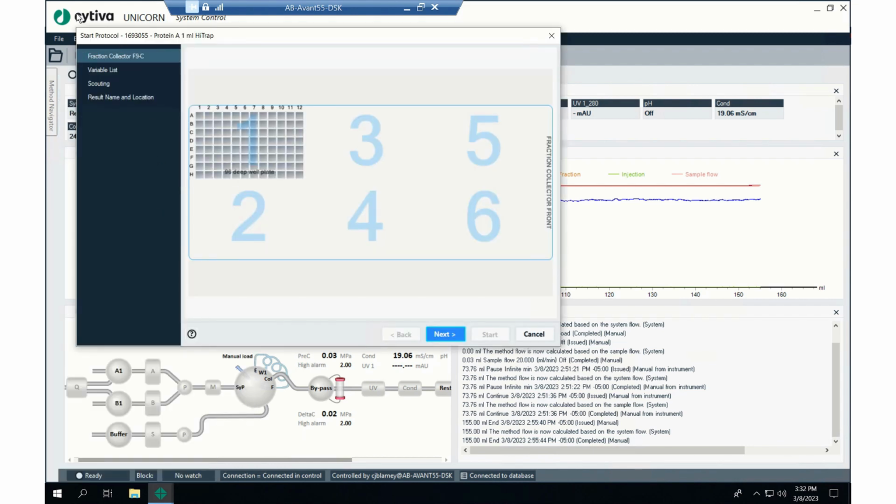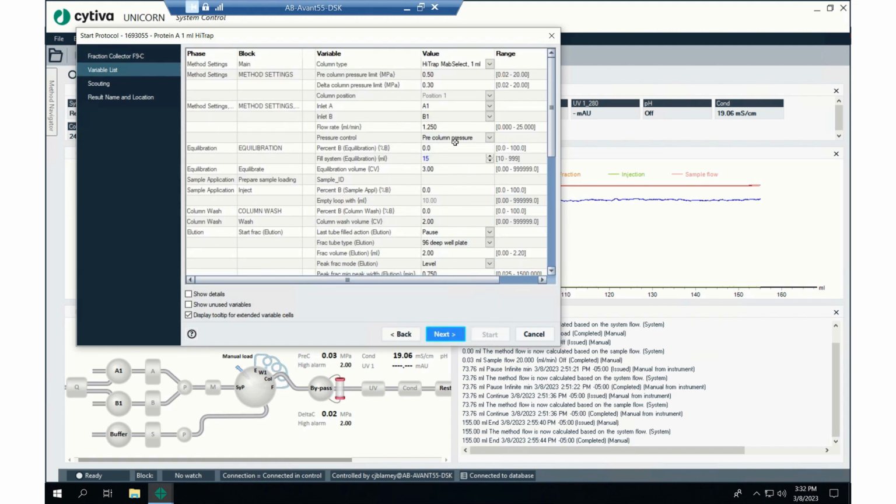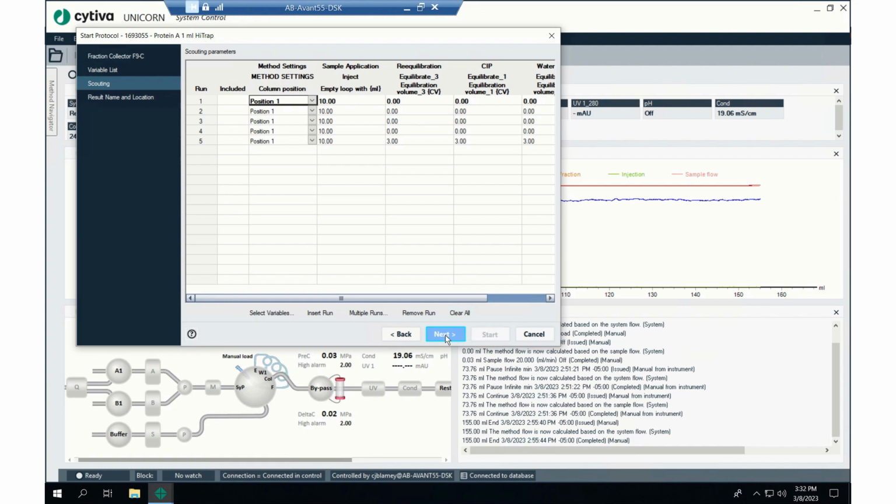Okay, so we're going to work our way through the start protocol. The fraction collector recognizes the 96 well plate. Then we're going to see the variable list. You'll notice here column position and empty loop width are grayed out. That's because we can't change them here, like we could the fill system if we wanted a different volume. We're going to be able to change these variables for the empty loop width and the column position in scouting. So we'll go to next.